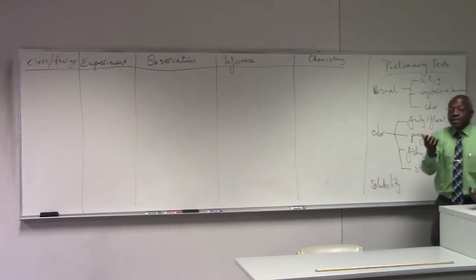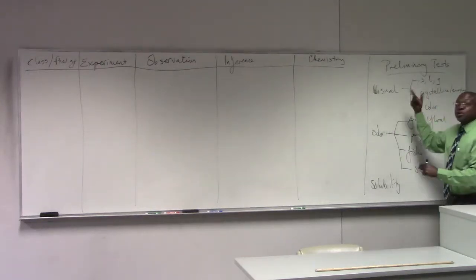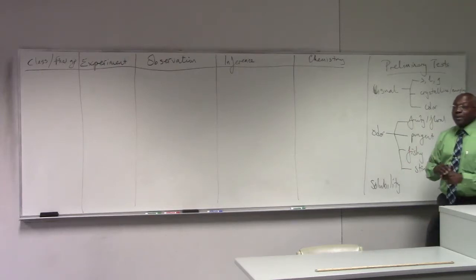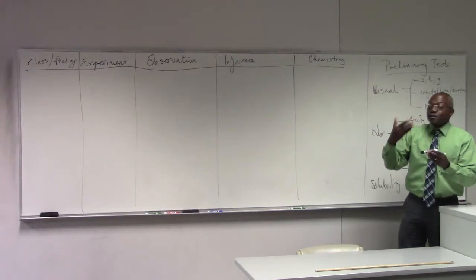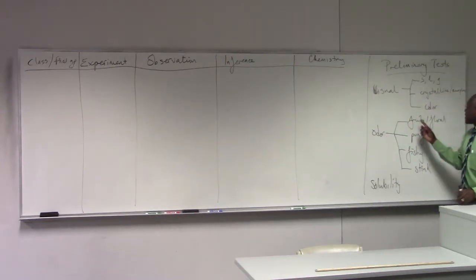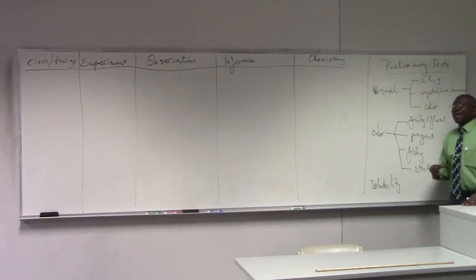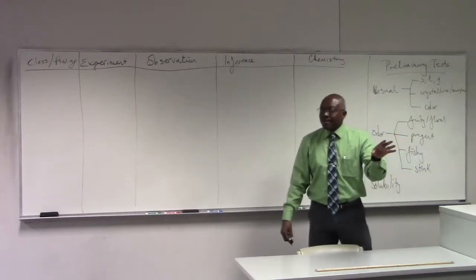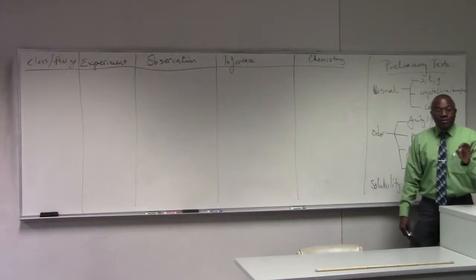You look at the sample and it takes you 5 seconds to observe it, and then those are the conclusions that come to mind. It takes you another 5 seconds to get a whiff of the compound. We don't just stuff it in our nose, right? We sort of waft the vapors towards ourselves. If it has a fruity or floral smell, and organic chemists distinguish fruity and floral from sweet, it's most likely an ester.